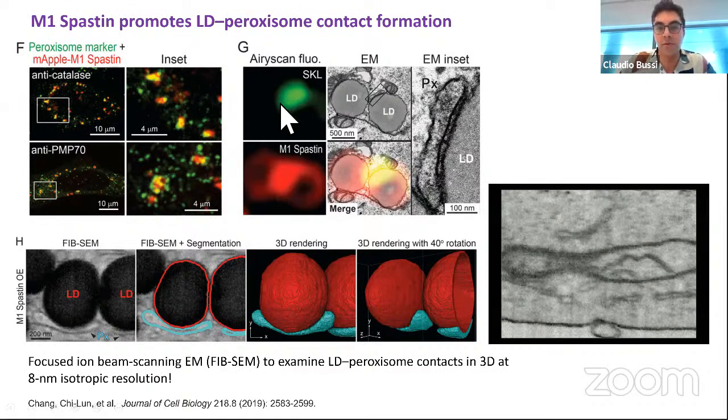Si ustedes ven la forma que está marcando acá, la forma que nos genera la fluorescencia verde en este caso, no pareciera ser una estructura tubular, parece más bien una vesícula redonda. Sin embargo, cuando ellos hacen el IM y la correlación, ven de que la estructura es más bien alargada, una estructura de peroxisomas tubular que no es de lo más común de encontrar.